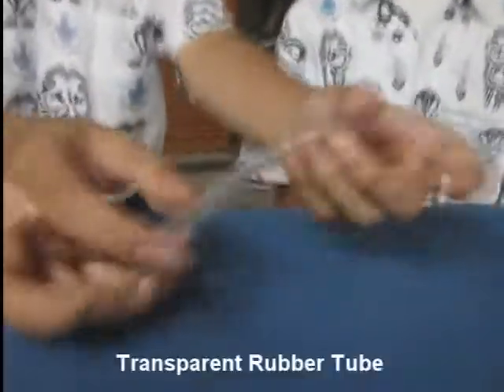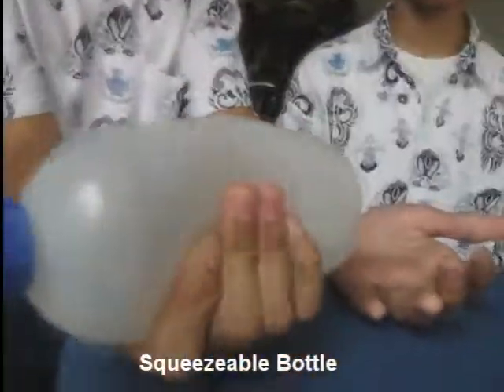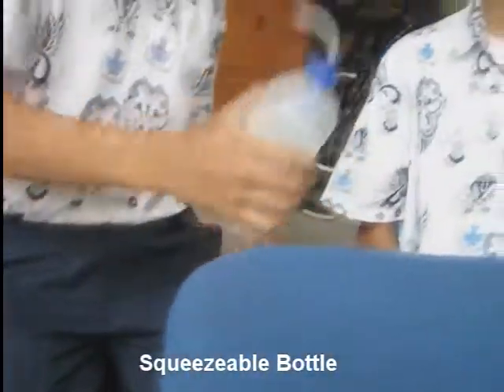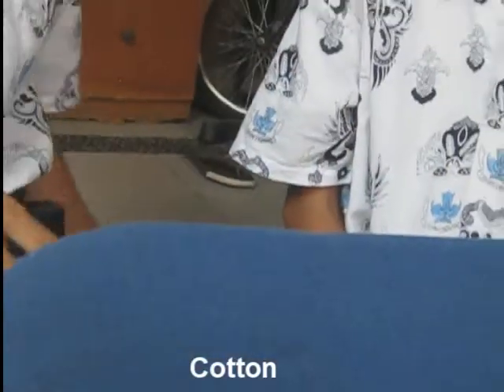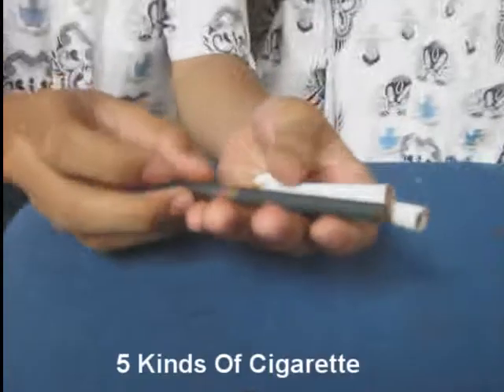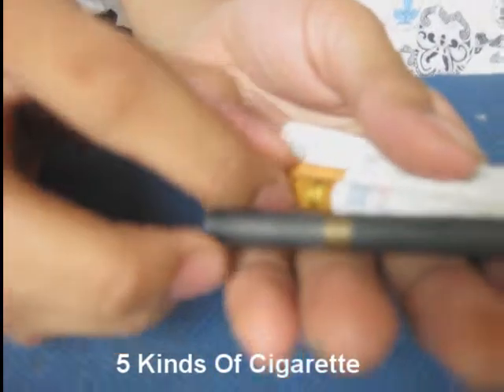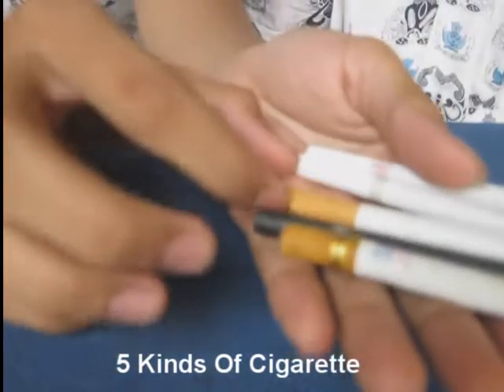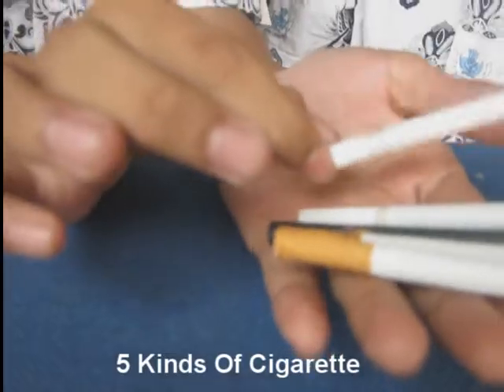The tools and the materials. First, transparent rubber pipe. And next, the squeezable bottle. And cotton. And five kinds of cigarettes: Nest Light Black, Gudang Garam, Marlboro, Nest Light White, and Sampurna Mild.